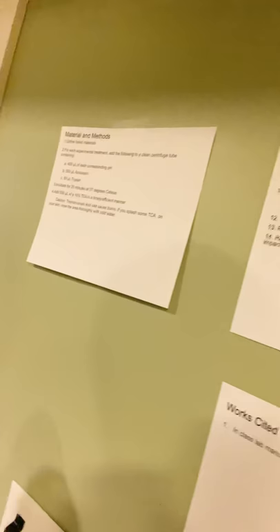We then transferred the supernatant to a clean cuvette. Before we could get the absorbance from it, we had to blank the spectrophotometer using a blank cuvette with water. We then read the absorbance in the spectrophotometer at 440 nanometers.